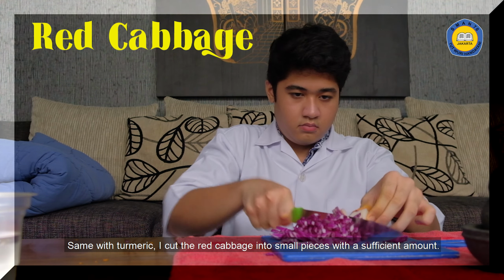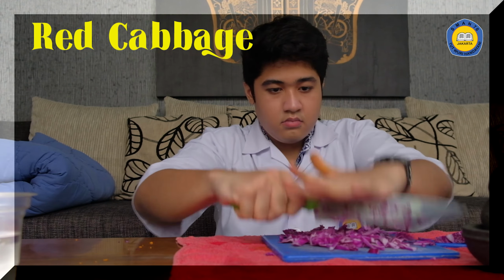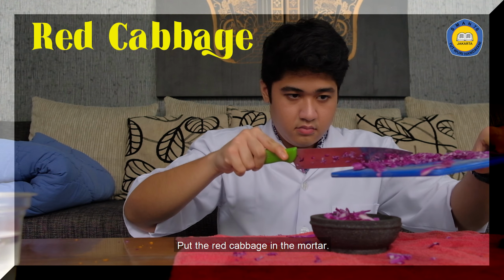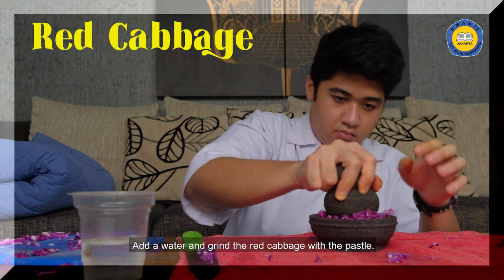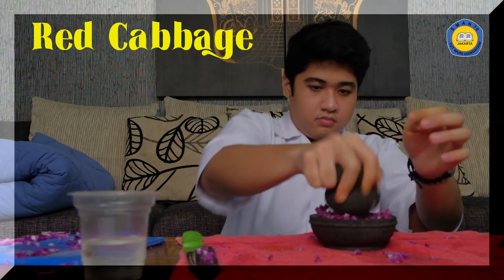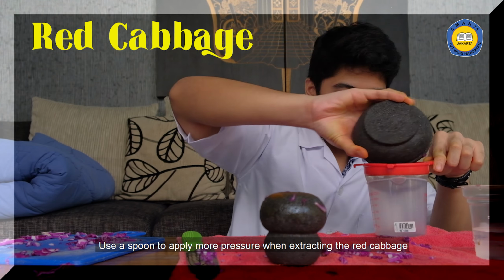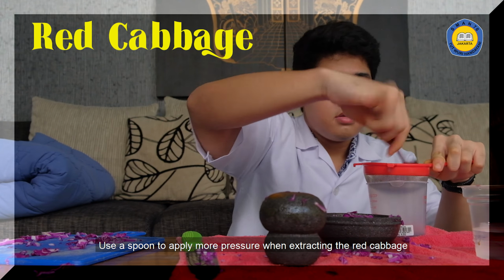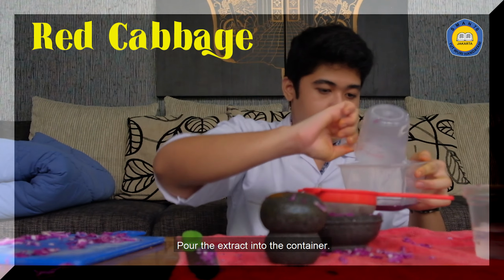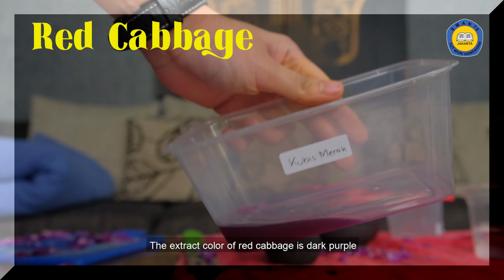Same as with the turmeric, I cut the red cabbage into small pieces with a sufficient amount. Put the red cabbage in the mortar. Add water and grind the red cabbage with the pestle. Extract the ground red cabbage with the filter. Use a spoon to apply more pressure when extracting the red cabbage. Pour the extract into the container. The color of the red cabbage extract is dark purple.